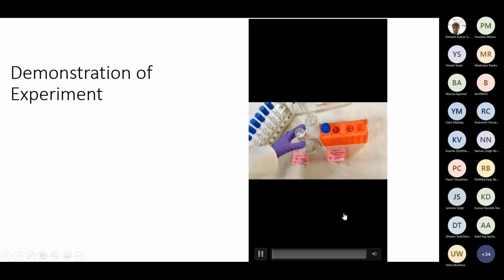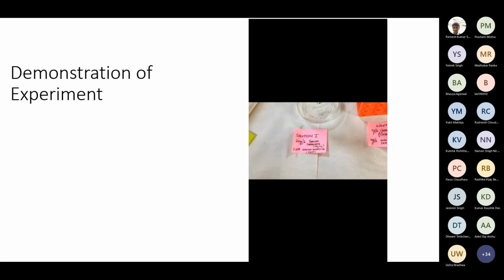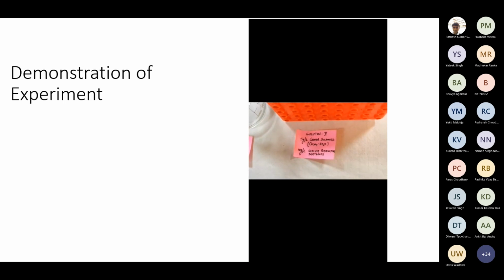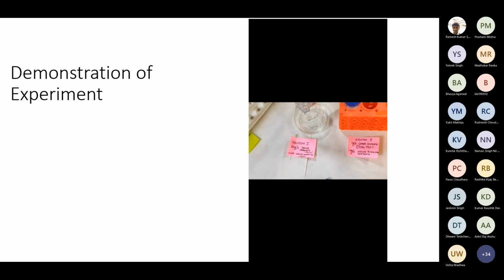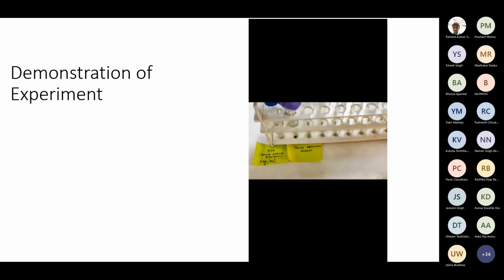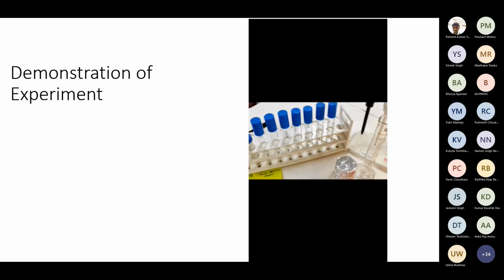These are the reagents required. First, solution 1, which is made of sodium carbonate and sodium hydroxide. Then solution 2, which is copper sulfate and sodium potassium tartrate. Before the experiment, these two solutions need to be mixed in appropriate proportion. Next, Folin's reagent, which is diluted with half of the volume of water, and then BSA stock solution, 1 mg per ml.